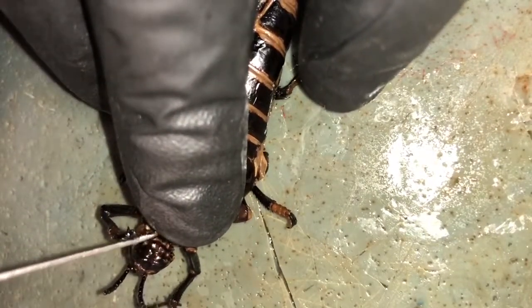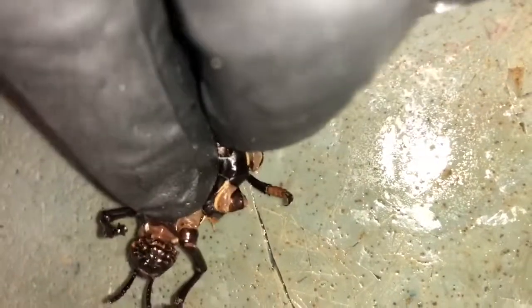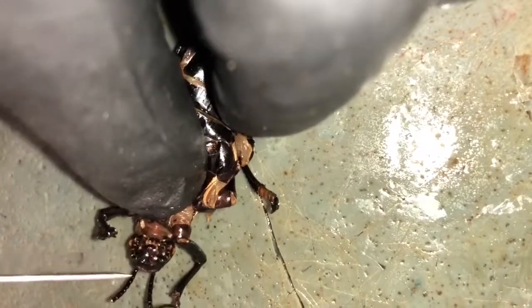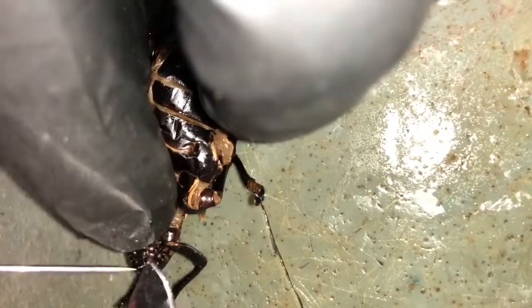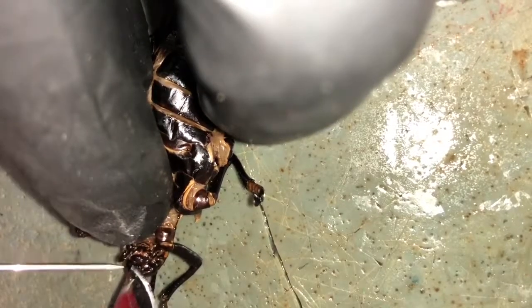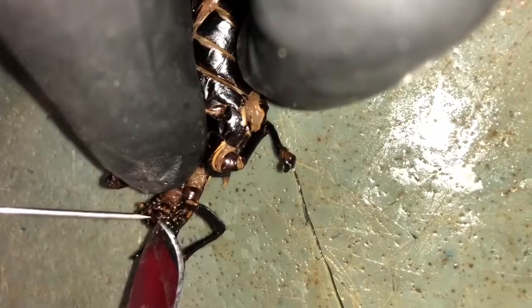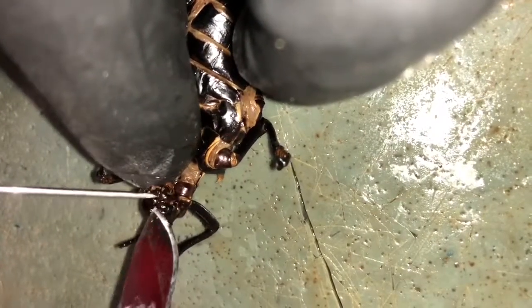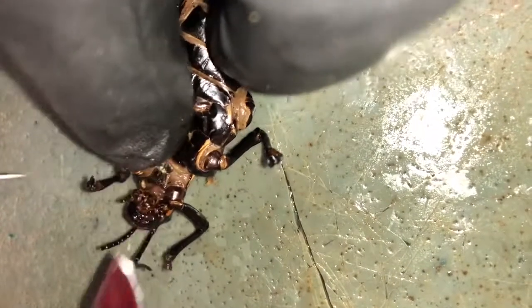Flip the labrum up. I'm trying to see. It takes a very steady hand. Labrum is here. I know. I'm trying to do both at the same time. We got a glimpse of it there for a second. There you are. Yep, very nice. Okay, hold that position.